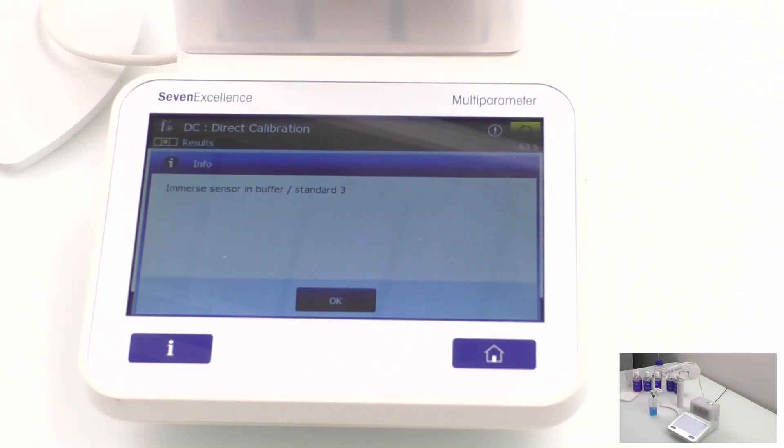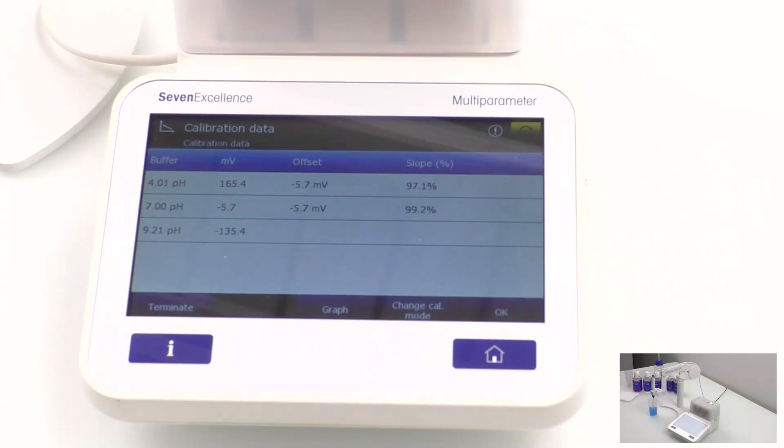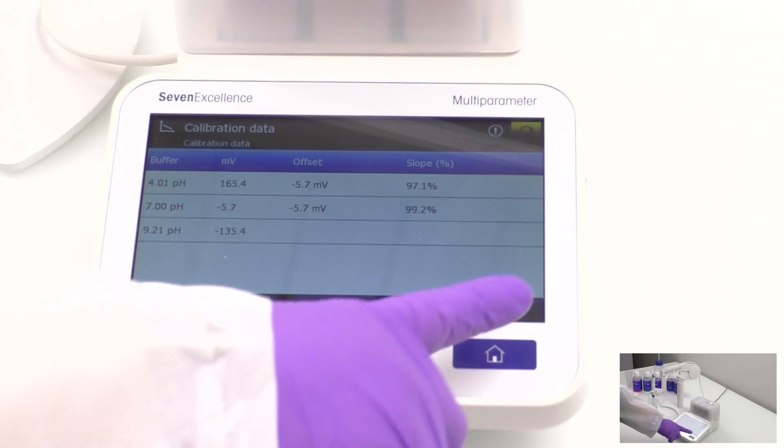Once you reach the endpoint of pH buffer 9.21, you will see a pop-up showing the results of the calibration as slope and offset. It will also indicate whether the calibration results fulfill the acceptance criteria. Confirm the message by clicking OK.